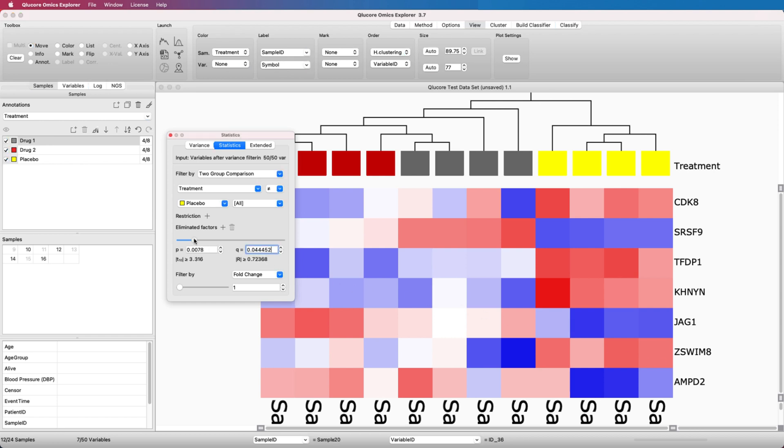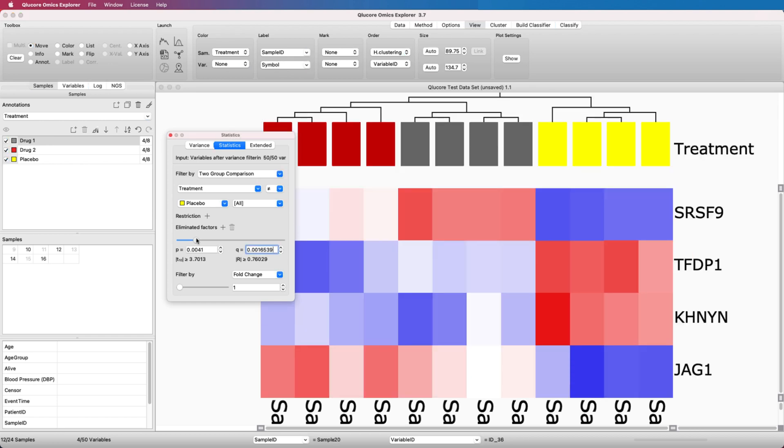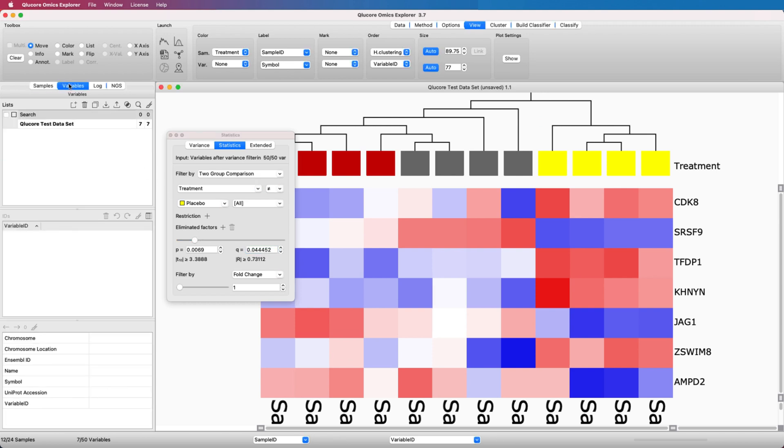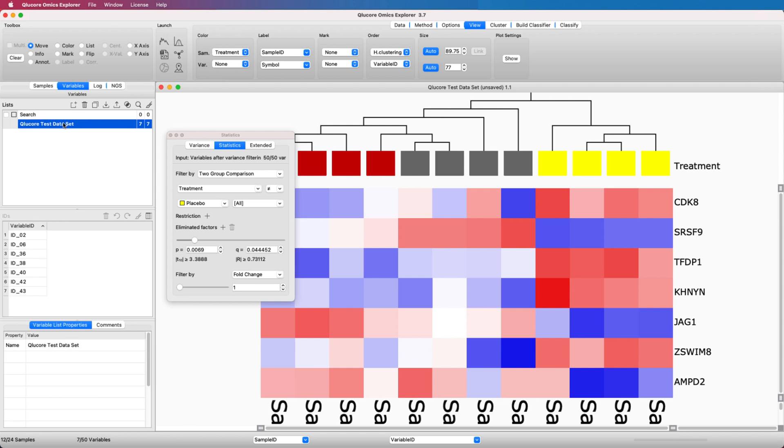The combination of the slider selection and the instant visual feedback makes it easy to fine-tune the results. The active variables are available in the active variable list in the Variable tab. This list is updated when you change a cutoff or move a slider.